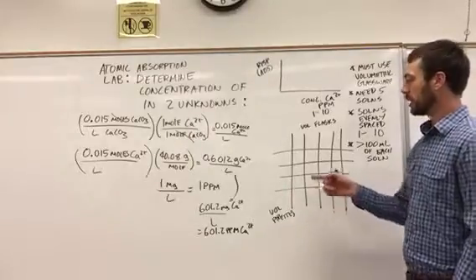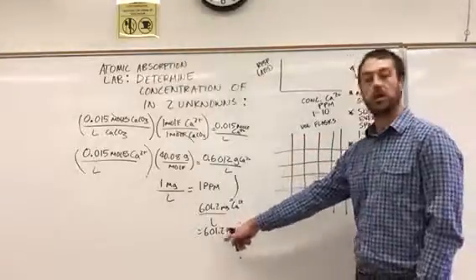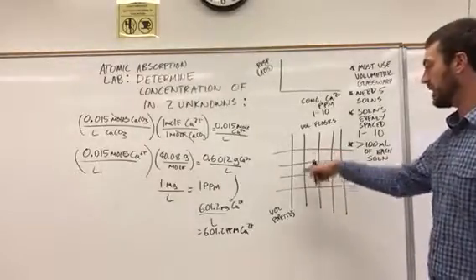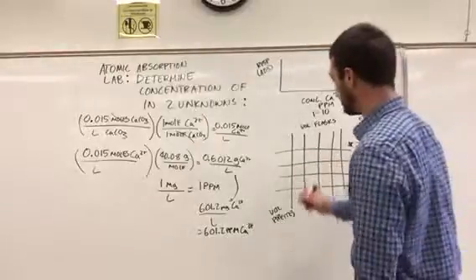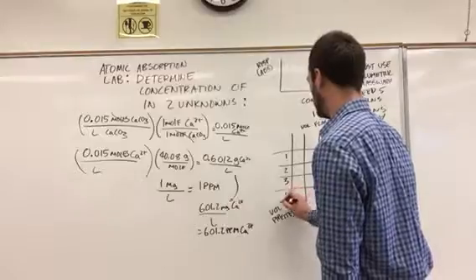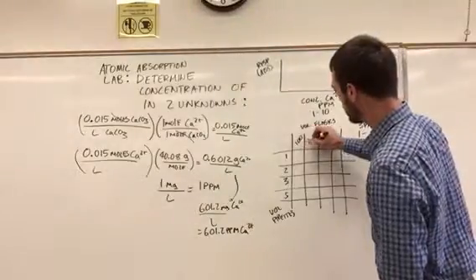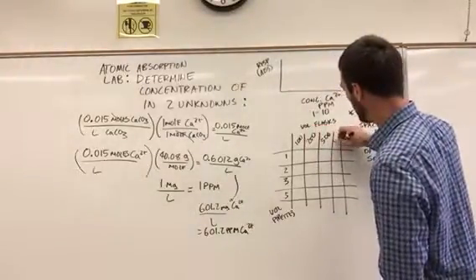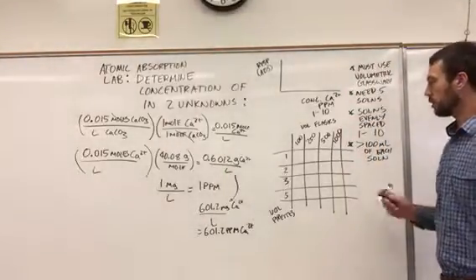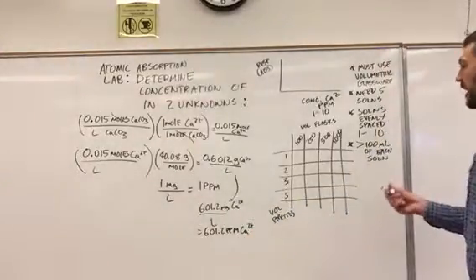What you're going to do is the M1V1 calculation using these 2 values and the concentration of the stock solution that you have, and then calculate what concentration you would get for each of those combinations. So your volumetric pipettes are 1, 2, 3, and 5. And your volumetric flasks are 100, 250, 500, and 1000. And the stock that we're going to use is this 601.2.